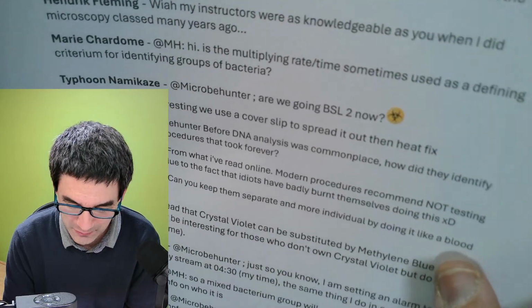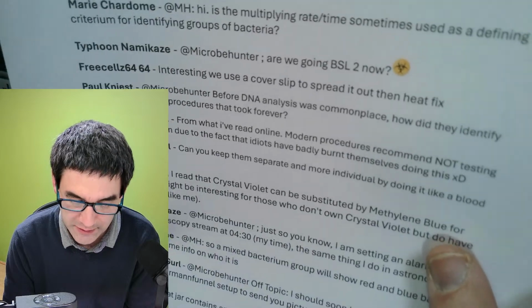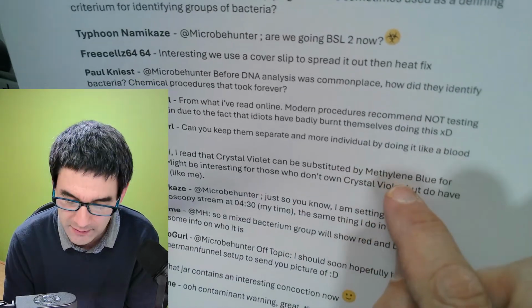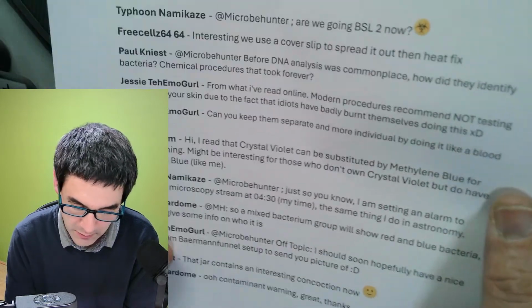And more, but doing it like a blood smear. I've read that crystal violet can be substituted by methylene blue for gram staining. Might be interesting.